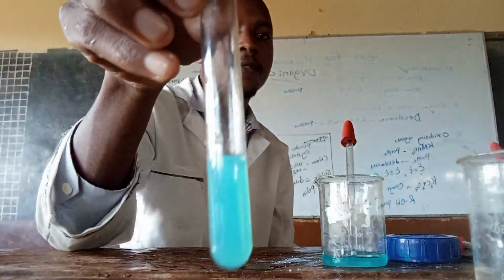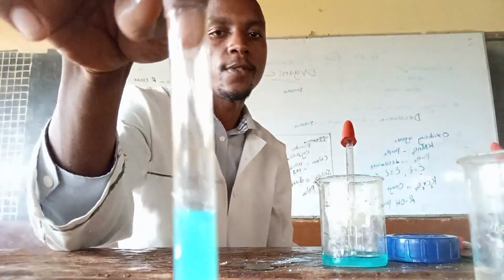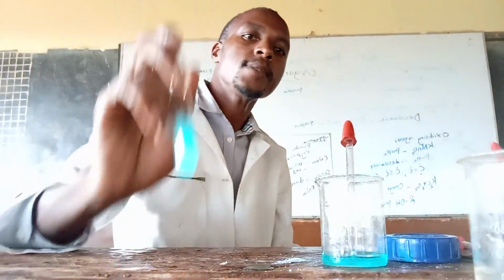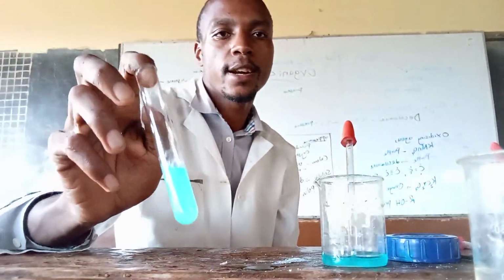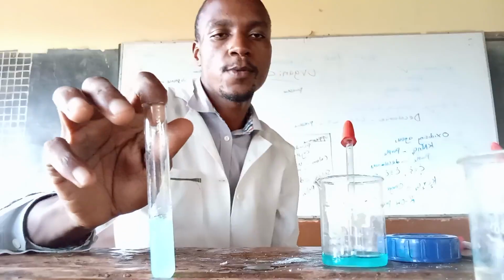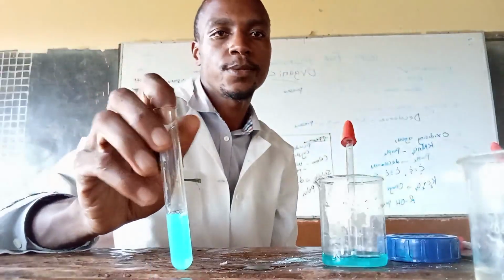Blue precipitate confirms the presence of copper ions. Let's meet in our next lesson as we check the next colored ion, which is iron ions.